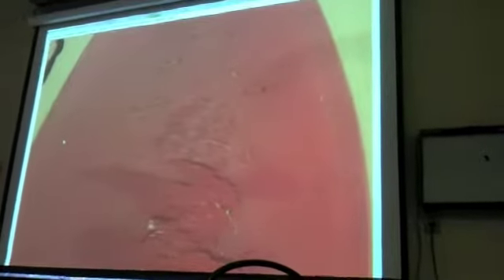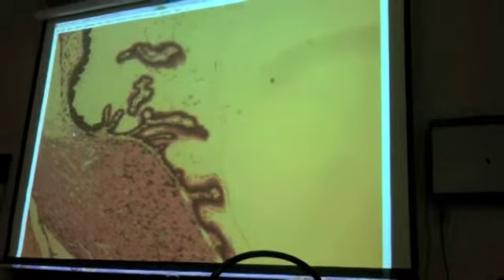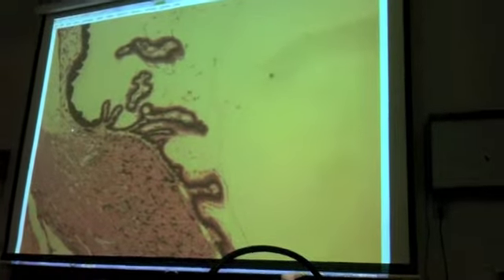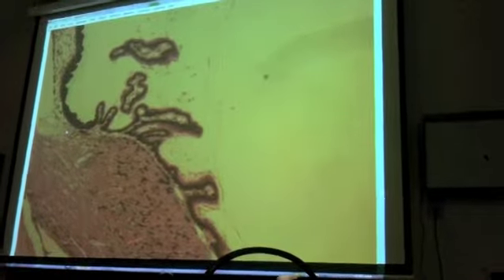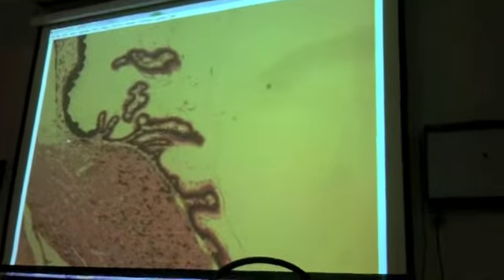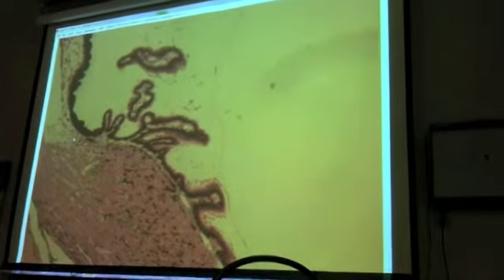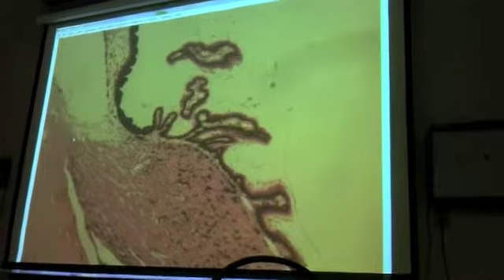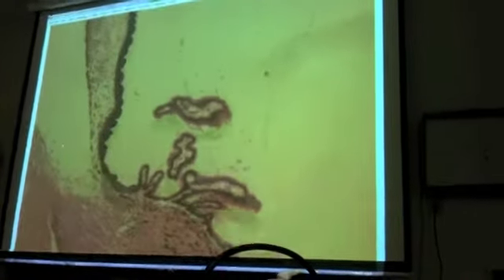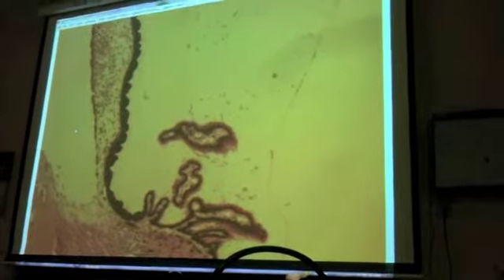Okay. So we come across the lens, and there's the other pointed end, and on this side there's our ciliary processes and ciliary body. Okay? I've got it described what that is. Now, as we come forward of the ciliary body, we find one more projection which is quite large.